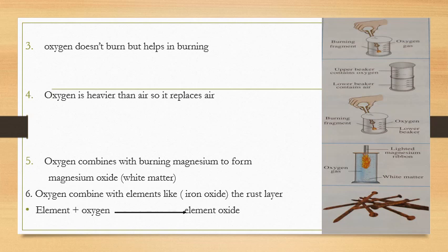We will observe that the glowing of the burning fragment increases when we place it in the beaker containing oxygen gas, and the beaker itself doesn't burn. So we concluded from this experiment that oxygen doesn't burn but it helps in burning.